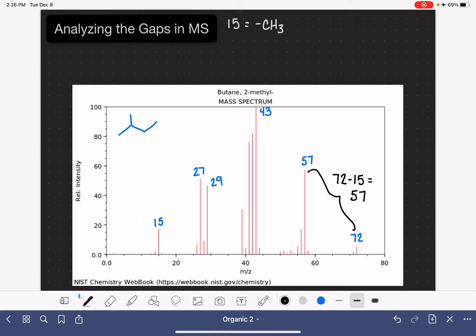Let's take a look at another gap. We have another gap right here, 43 minus 57, other way around 57 minus 43. That corresponds to 14. That looks like that could be due to the loss of a CH2. So if we have a gap of 14, that most likely corresponds to a CH2.